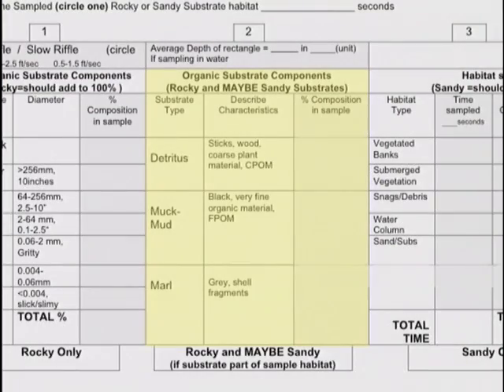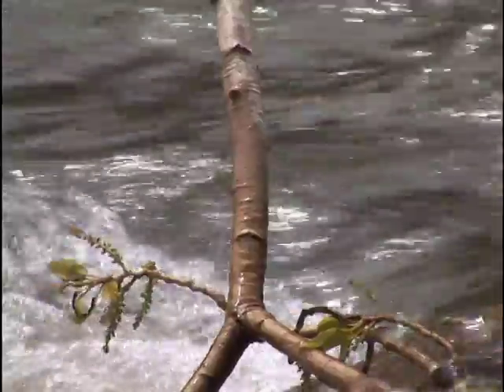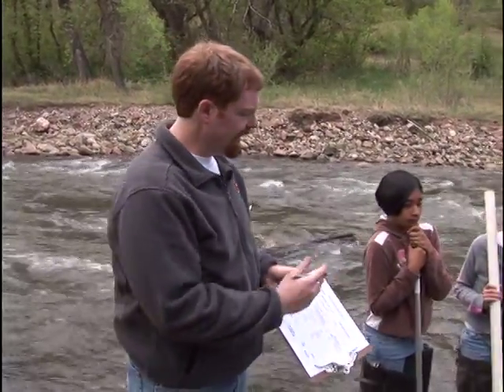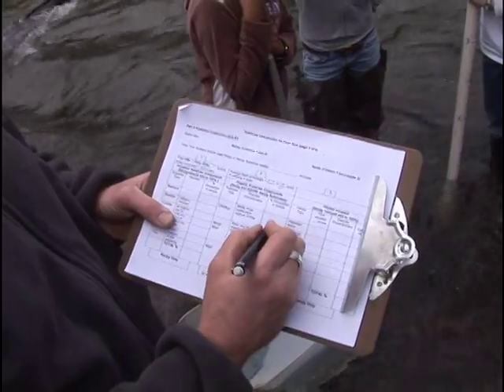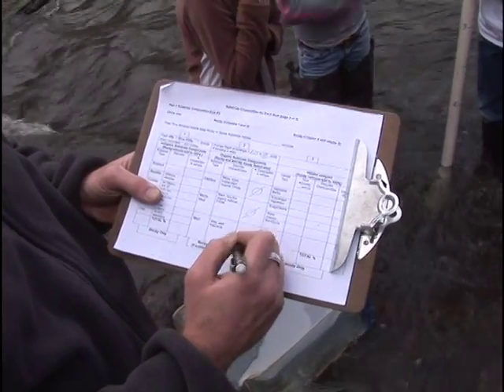We also need to understand if there's any organic substrate within our kick area. Organic substrate are fallen logs, leaves, things like this. Not rocks, not sand, not inorganic components. In this kick area, there is 0 organic debris. Put zeros in every column.